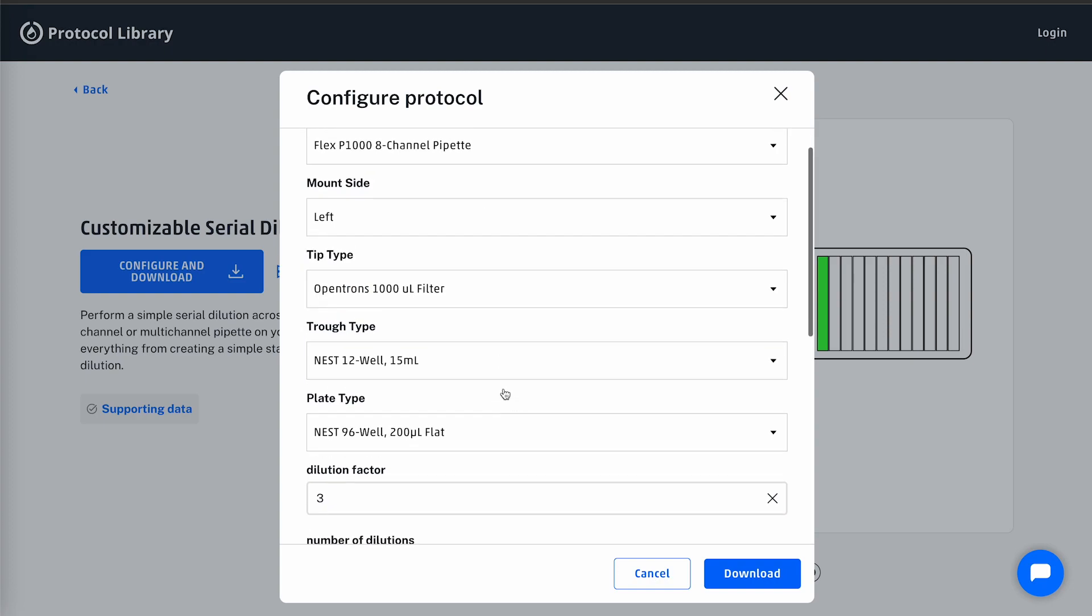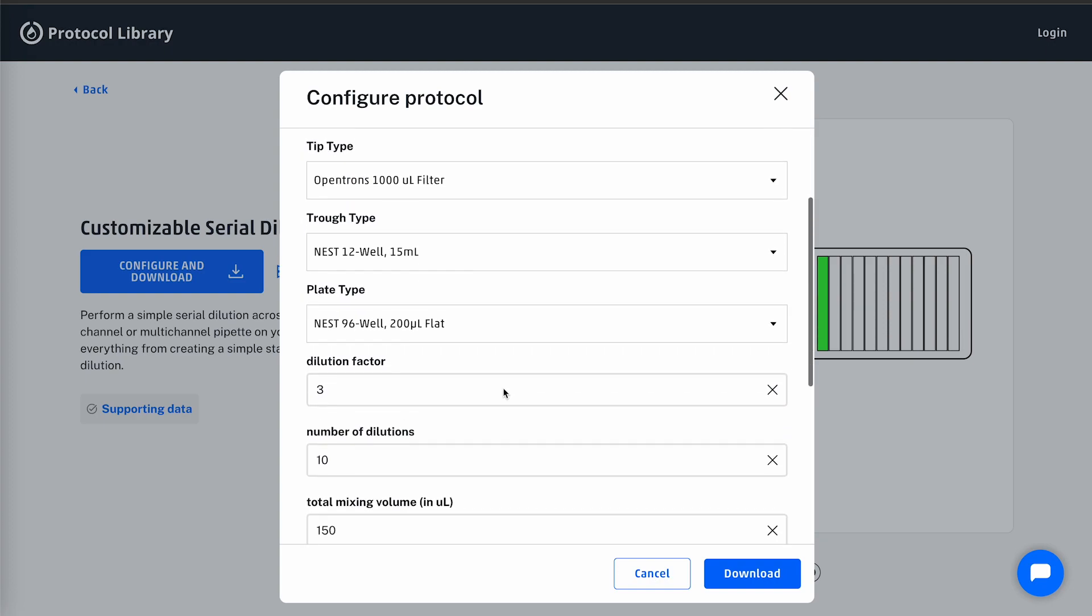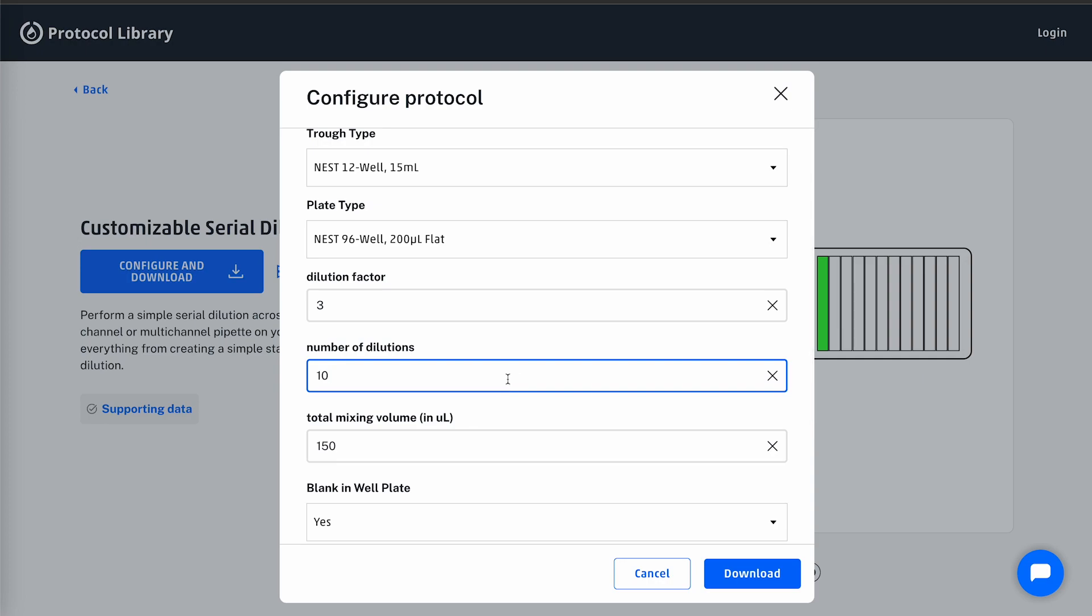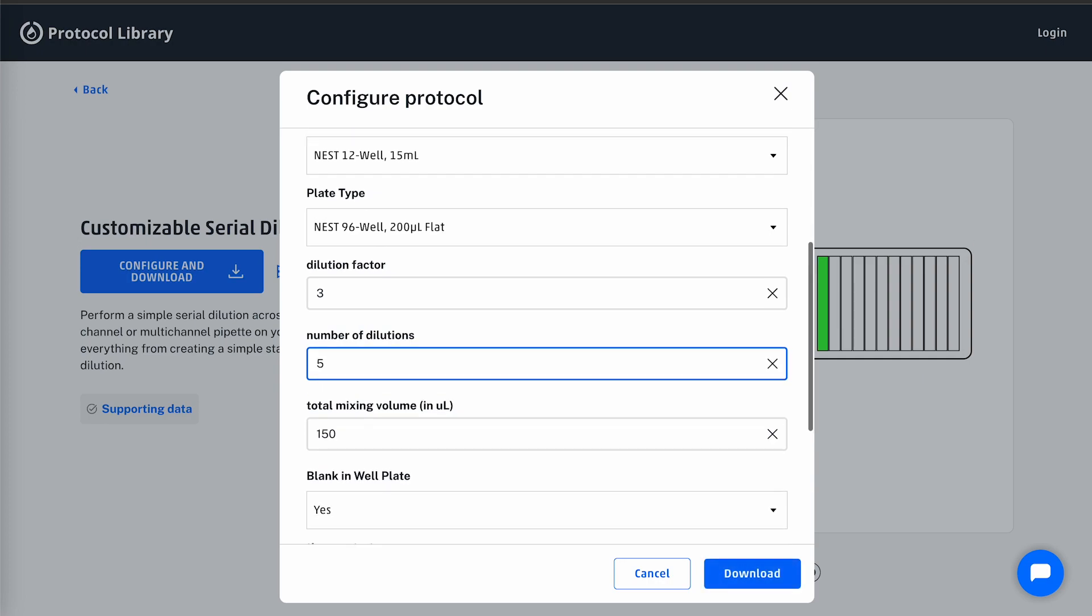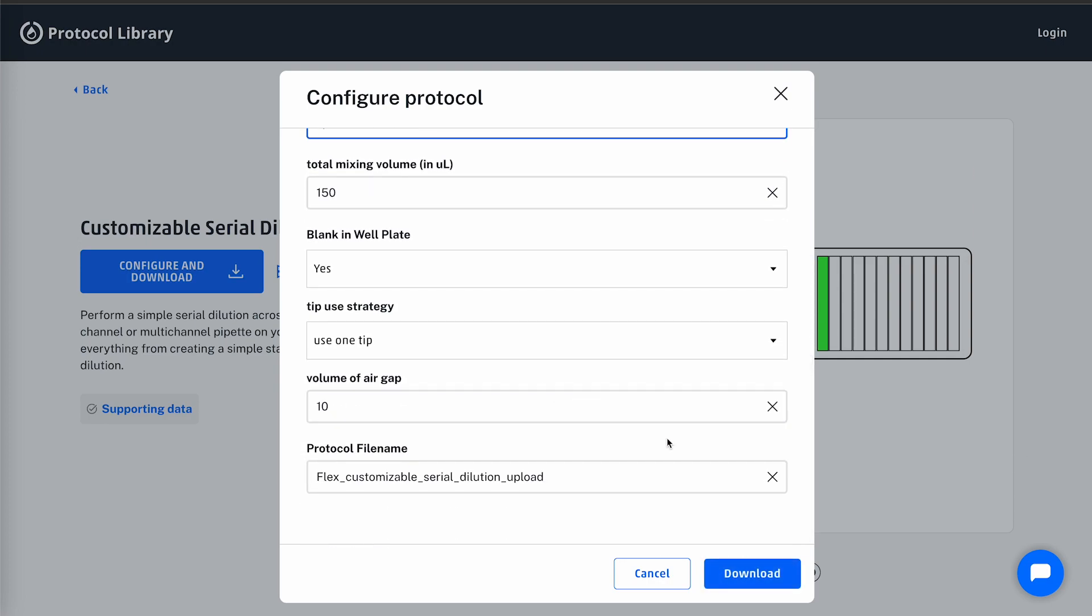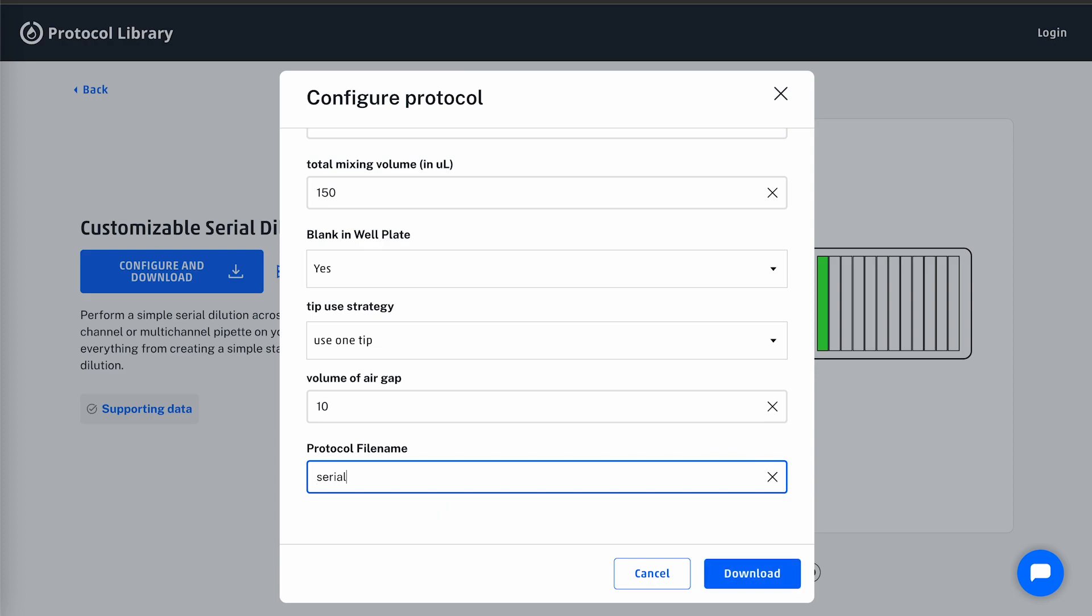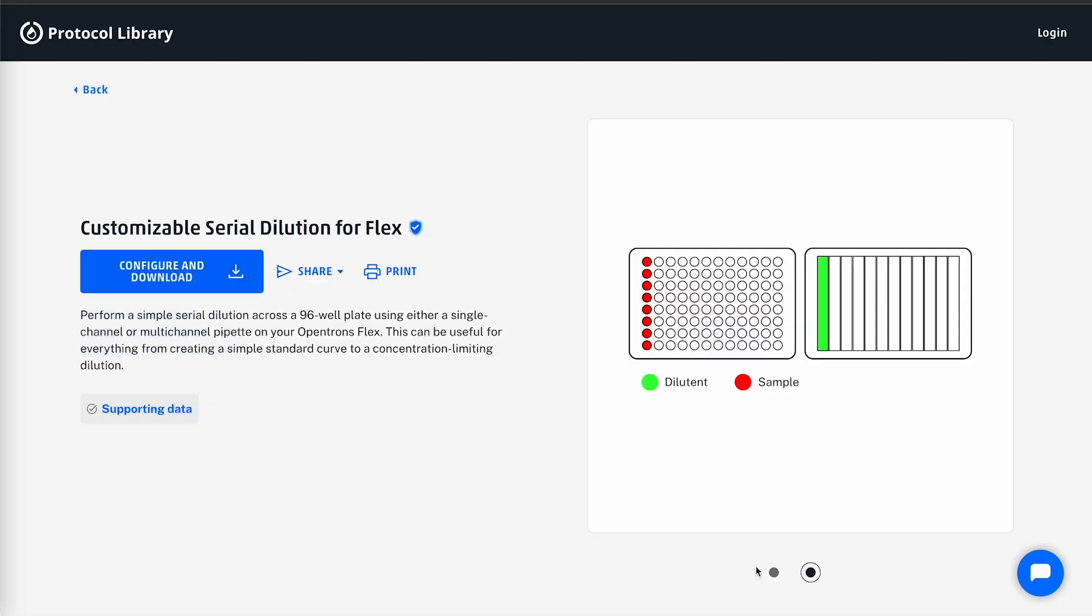I will also decrease the number of dilutions from 10 to 5 and rename the protocol file name so it's easier for me to remember and track versions of. Lastly, I will download the protocol.